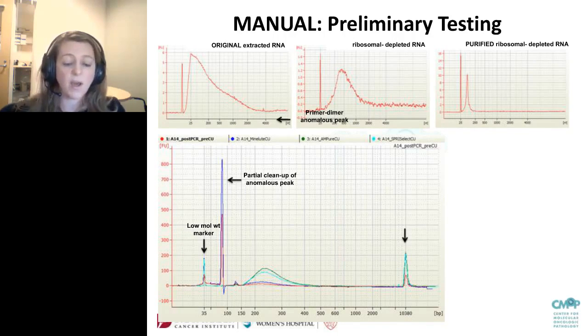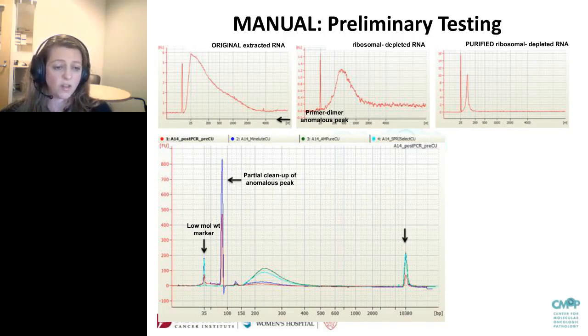This is the bioanalyzer trace. Typically, when the quality of the RNA is good, you see 2 distinct peaks representing 18S and 28S, usually in a ratio of 2:1, which gives you a pretty high RIN number. In our case, most of our samples look different.